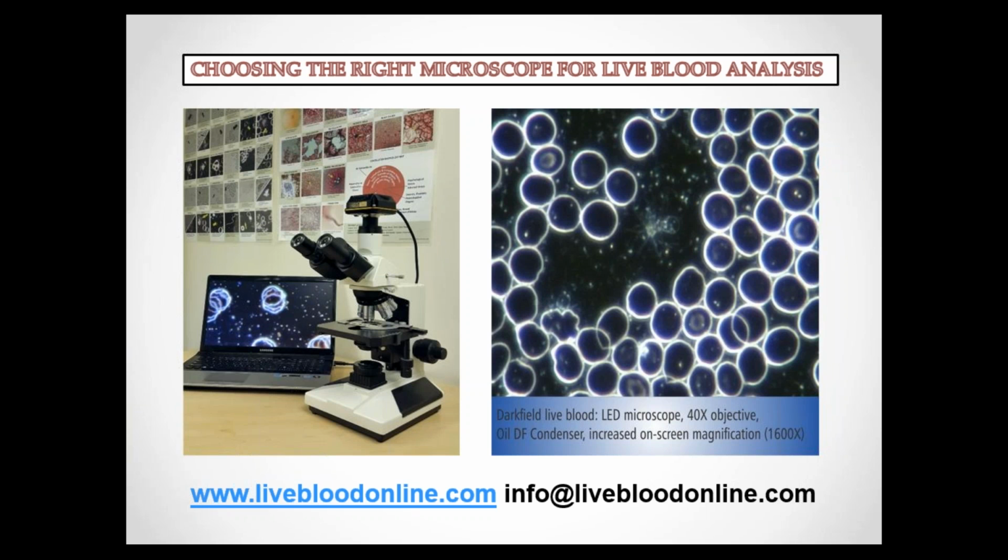With a normal bright field condenser, the light is simply allowed to go directly straight through the sample, and that's the normal way of viewing samples with standard laboratory microscopy.